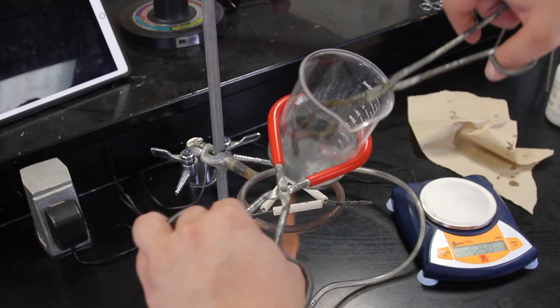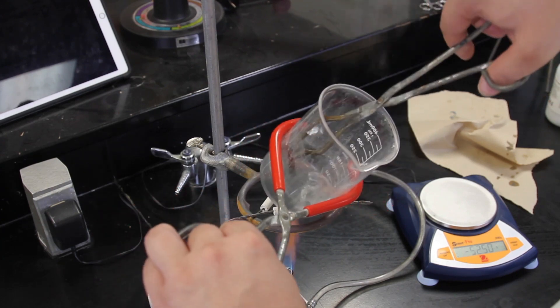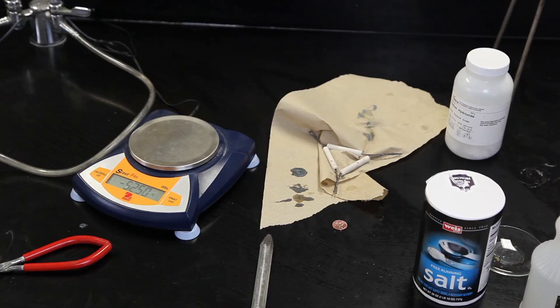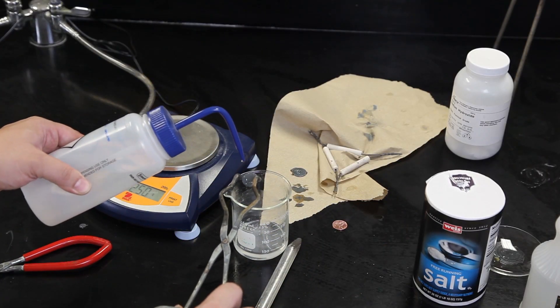Turn the coins over several times during heating to make sure they get an even coating of zinc. After the coins are coated with silver coloring, they can be rinsed with distilled water.